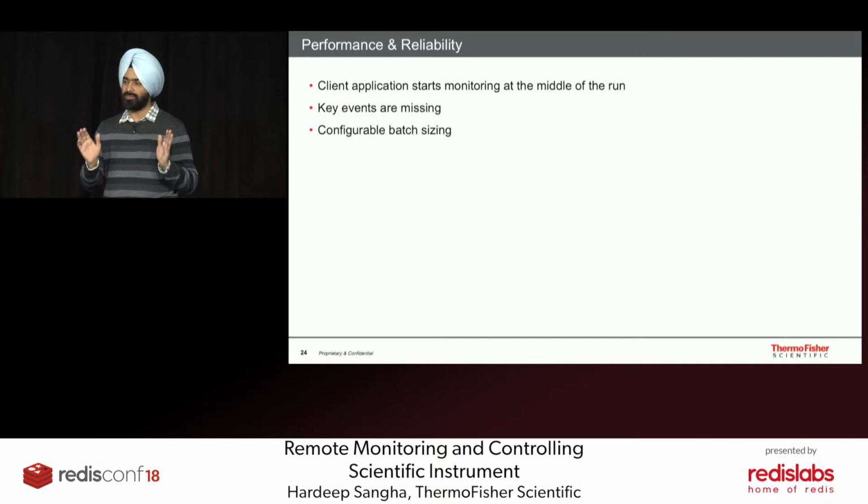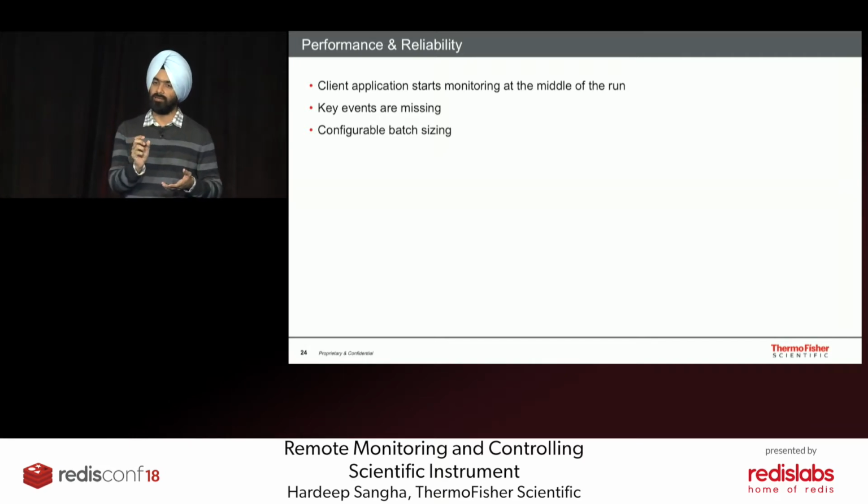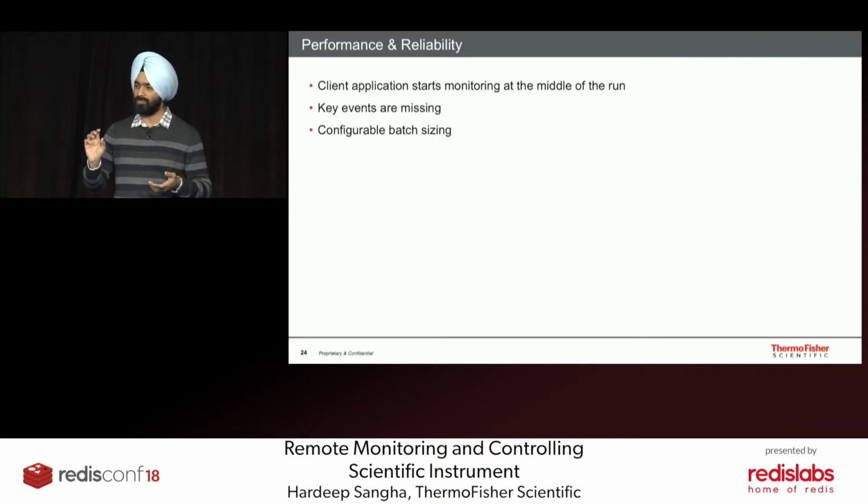We need certain things in our user interface to formulate what the different injections are. What if one of them is missing? The other key thing here is that there are limitations on the IoT pipeline using MQTT. What's your message size? You have to be within those bounds. Some of our messages are big, and we can't send them as a single message.